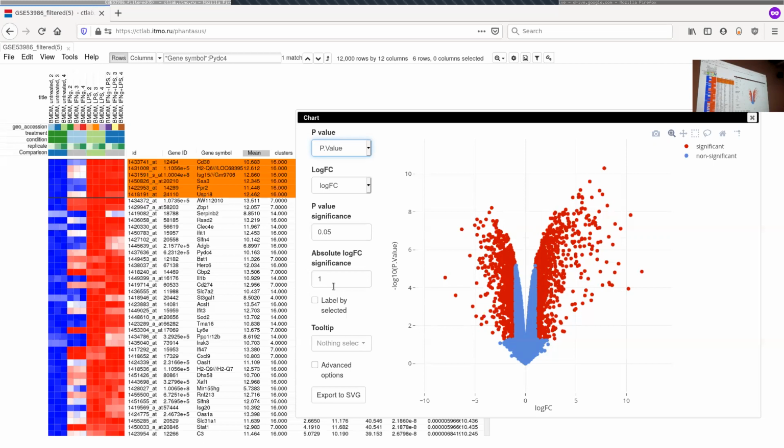However, overall, the results will be more or less correlated. As I said, there is this effect size, in our case log change, and there is statistical significance. But I would like to remind you that this course is about you, as a computational biologist, not a bioinformatician, trying to find genes that are biologically significant, not statistically significant.